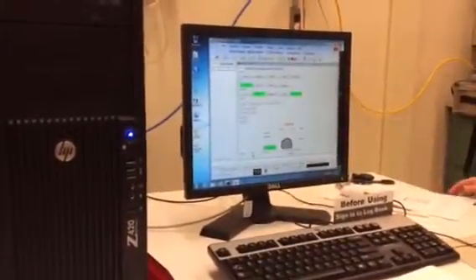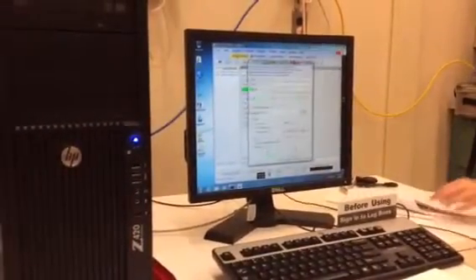All right, now what we're gonna do, and I'm gonna let you drive, Olga. I'm just gonna kind of give you some guidance. Here, I'll move this chair. Okay, so what we're gonna do is we're gonna set up a file for F19. So just go ahead and type new or click new, create your data file.